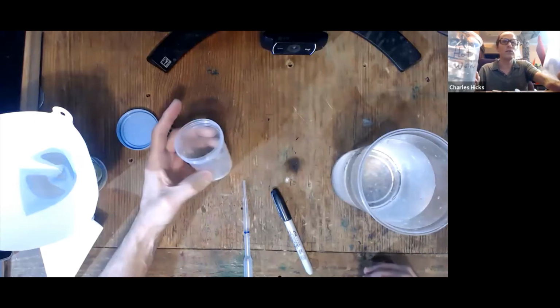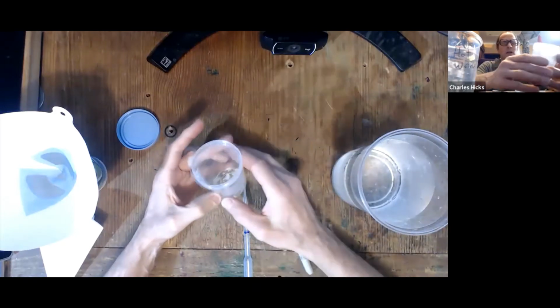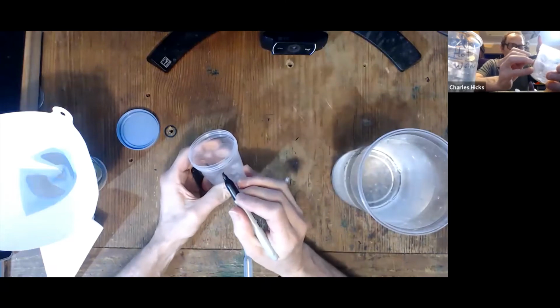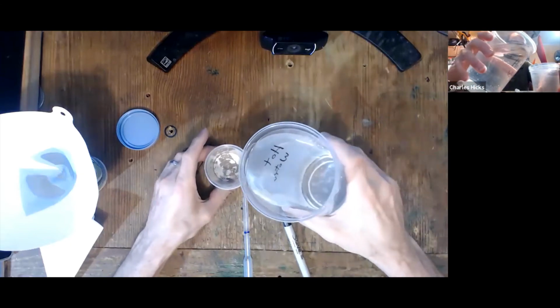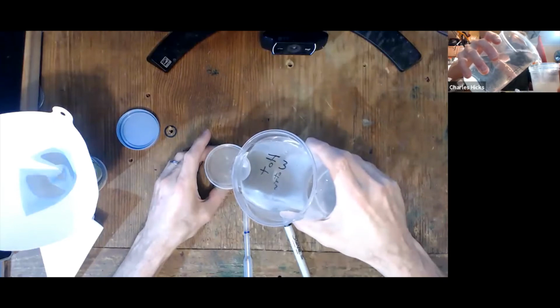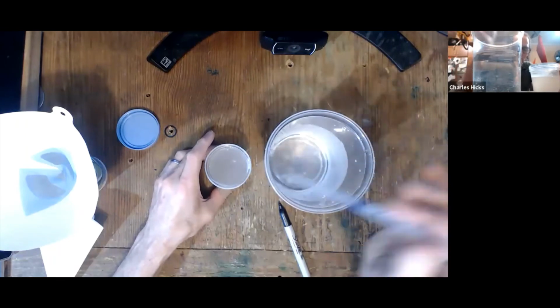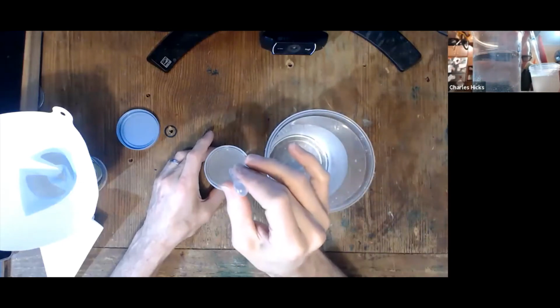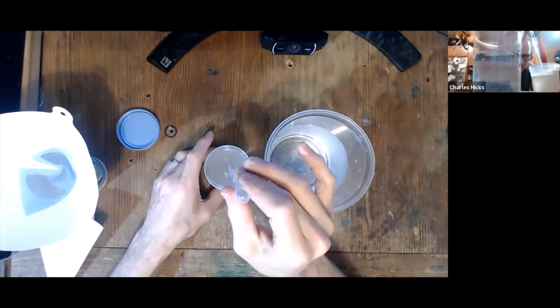What I want to do is transfer 100 milliliters of the hot tap water into here, and I want that to be measured as carefully as I can. There are markings on this container. They're a little hard to read, but if you want to take a marker and locate the 100 ml marking, and make it a little clearer to read, that's a good idea, I think. Then add the hot water until you're close to that mark. And once you're close, use a dropper to adjust as precisely as you can right up to the 100 ml mark. Okay.